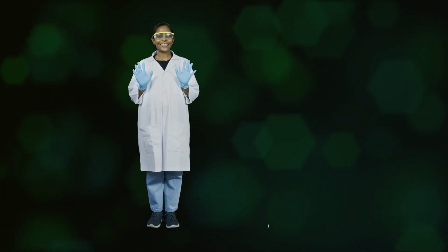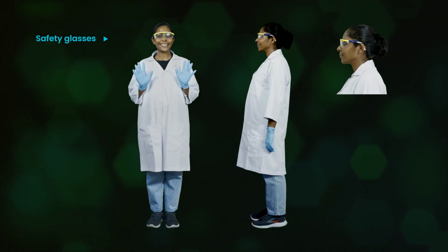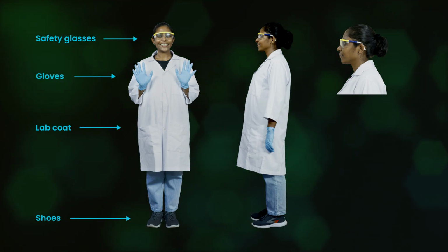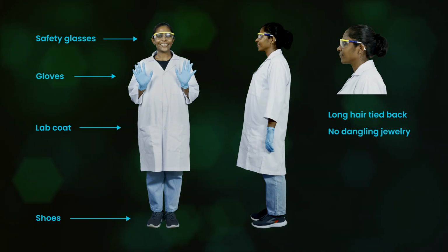Before conducting the flame test, wear personal protective equipment, including safety glasses, a lab coat, gloves, and closed-toe shoes. Make sure your long hair is tied back. Avoid wearing dangling jewelry.